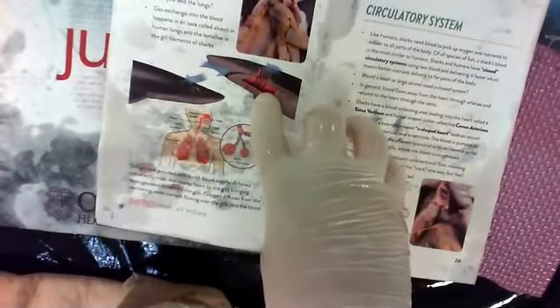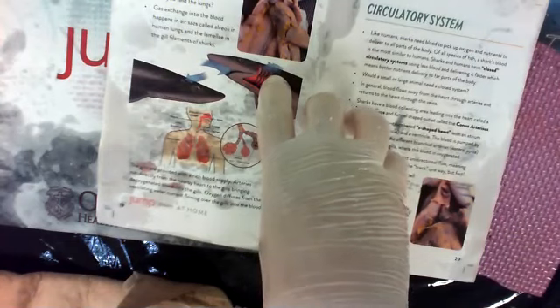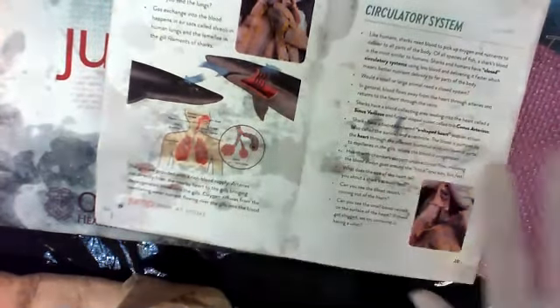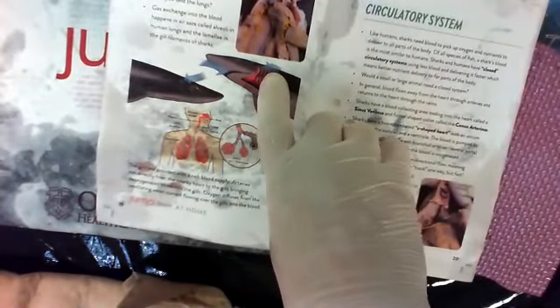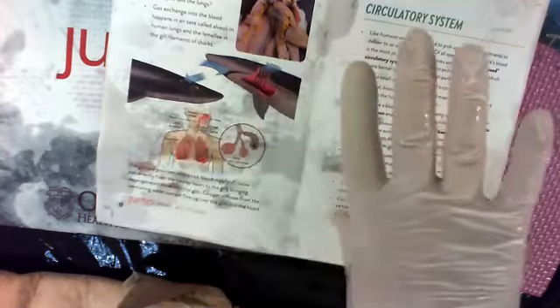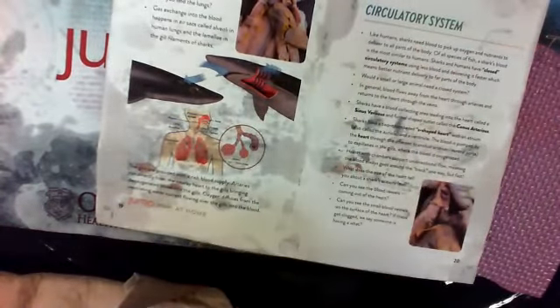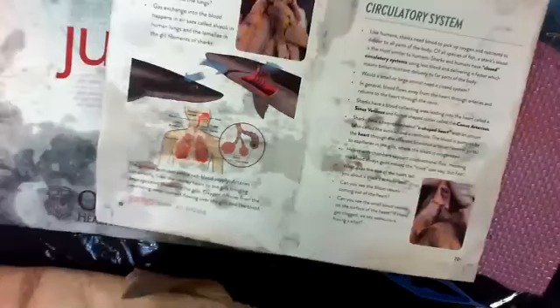It's never going to be blue, right? It shouldn't be blue. But if that fish has been in the market and out of water for days, it'll be a dark red because all the oxygen actually escaped back into the air or is broken down and moved along. So if you buy a fish that has dark red gills, don't buy it. Go for the ones that are fresh red. Hey, parents, when you go out shopping for fish, let's take a peek at those gills. You look like a genius.